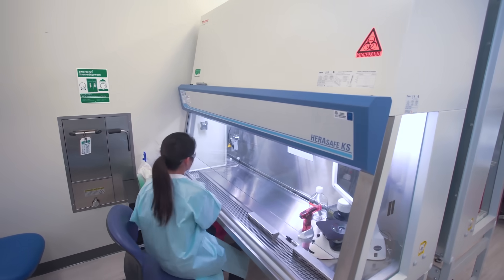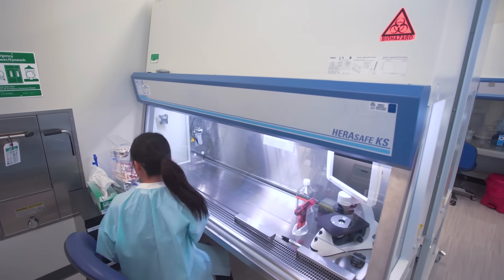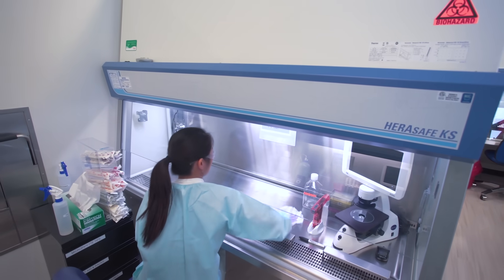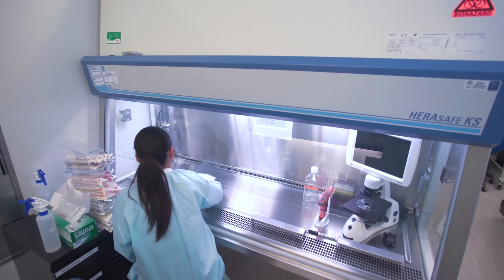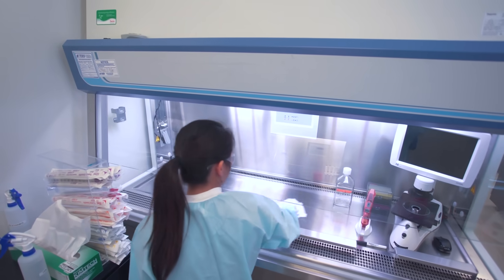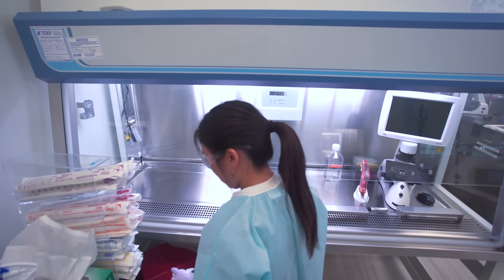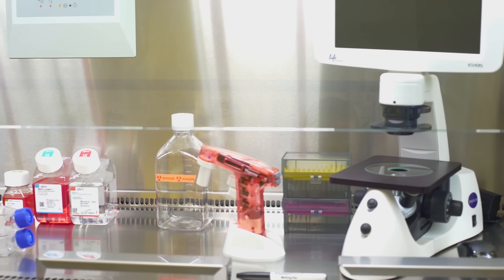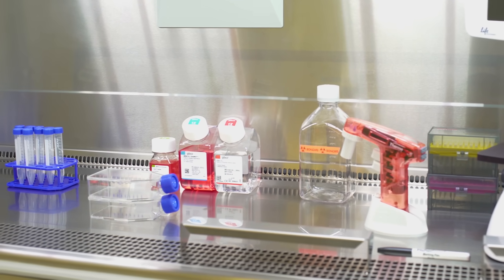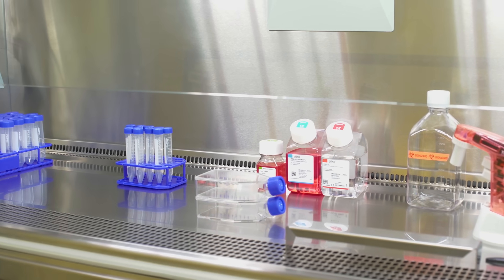When working under the hood, make sure the hood sash is at the proper height. Correct chair height and body position prevent shoulder stress and also helps prevent contamination. Never breathe or talk into the hood. Wipe the hood with 70% ethanol before and after use. Each item in the hood should be sprayed with 70% ethanol and wiped clean. Items within the hood are usually placed as follows: pipette aid in front, reagents in back, tube rack in the rear left, small container to hold liquid waste in the back right, and your cell plates in the center.